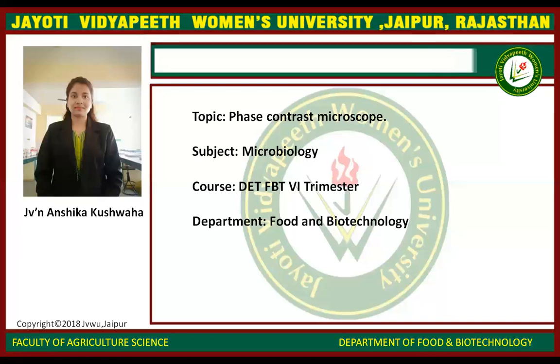In positive phase contrast, the background light is instead phase shifted by plus 90 degrees, so the background light will be 180 degrees out of phase relative to the scattered light. It leads to formation of an image where the foreground is darker than the background. So, how is the slide prepared? First is growing cells, second is fixing cells, and third is sectioning the specimen.